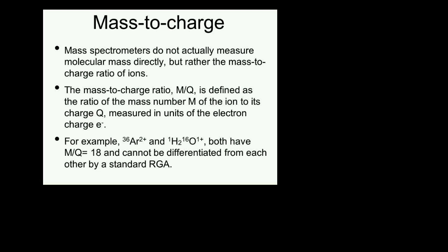So, for example, why is this important? Because, for example, take the argon isotope 36 and take the water molecule.